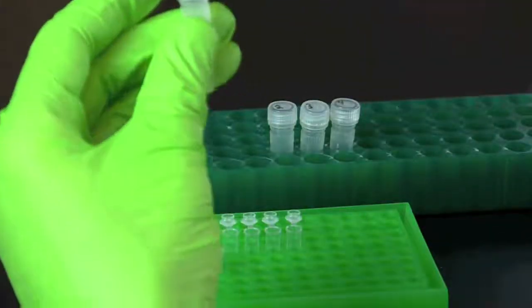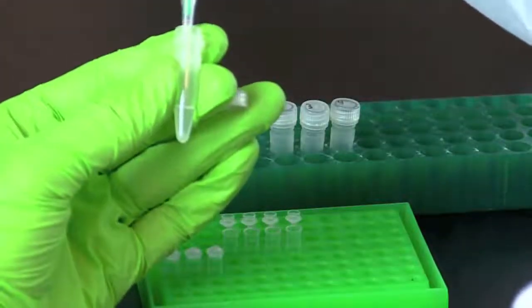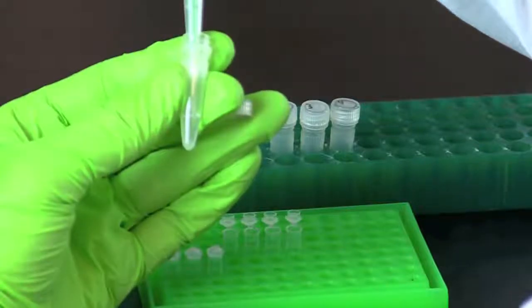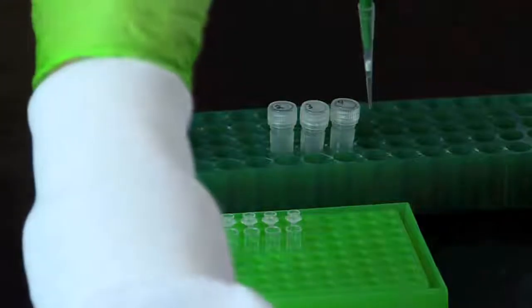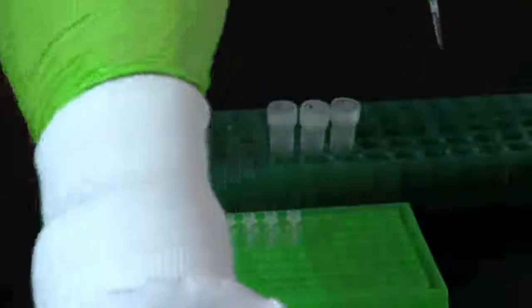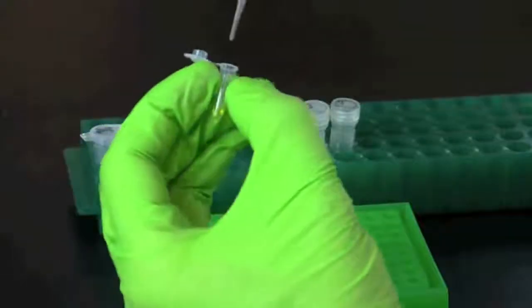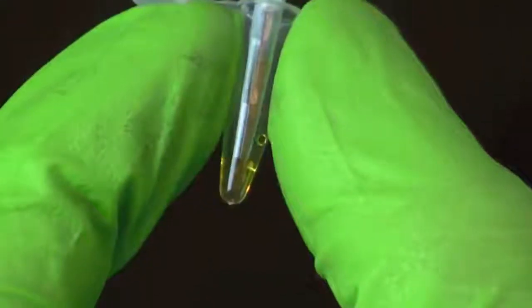Pipet 20 microliters of DNA template into the correspondingly labeled PCR tube. Avoid disturbing or transferring the pellet of instagene matrix, which is at the bottom of the student's samples. Pipet up and down to thoroughly mix the DNA template and the master mix.